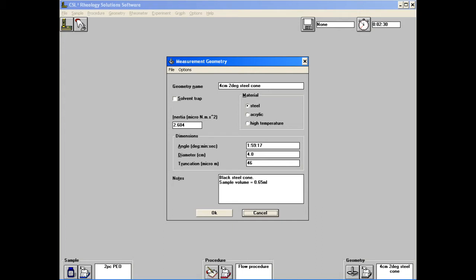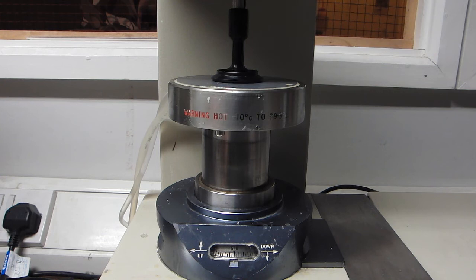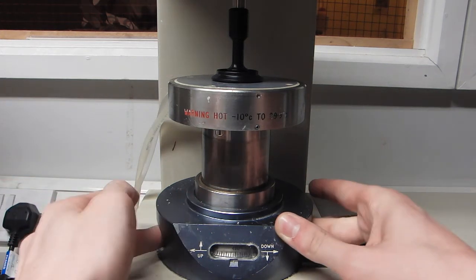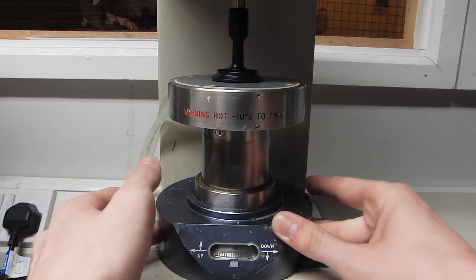Ideally, the plate should be at the level where the untruncated cone's tip would be. To achieve this, we first use the software control to move the ram upwards. The plate is then raised until the geometry stops spinning, telling us that the plate and cone are in contact. We can then use the scale to lower the plate by the relevant number of microns.